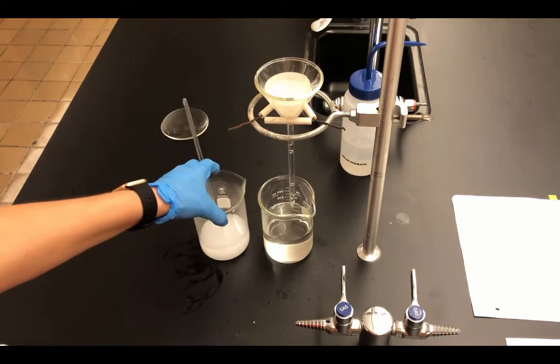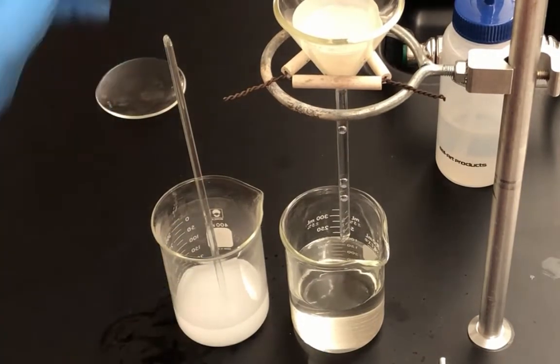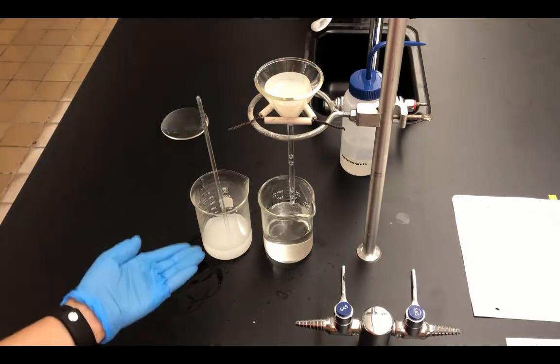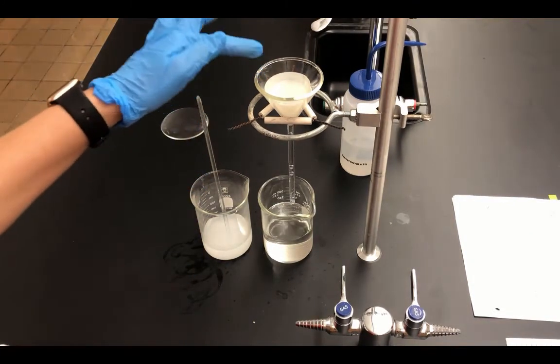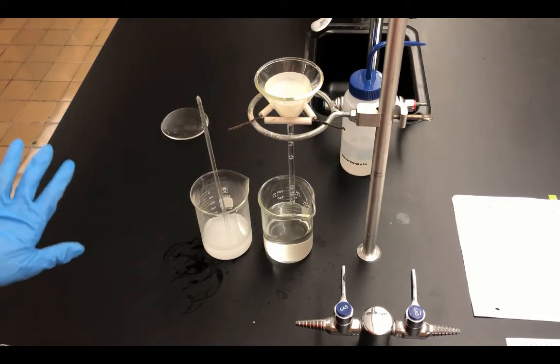And then again, you can notice the filtrate down here. You can look at the difference between the precipitated solution and just the filtrate. And then we have our solid that is up here in the filter paper. So once we're completely done filtering, we will remove this filter paper, put it onto a watch glass, and put it into the drying oven.